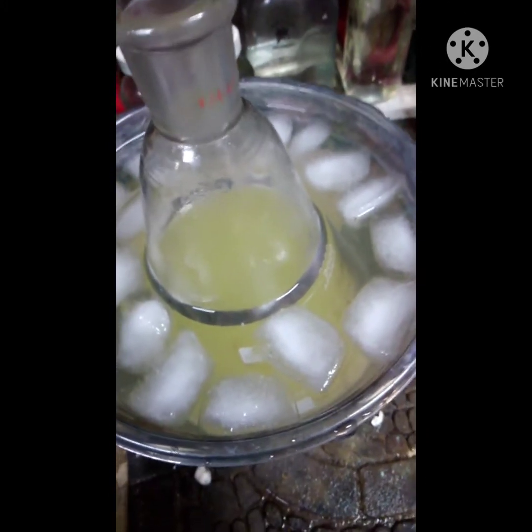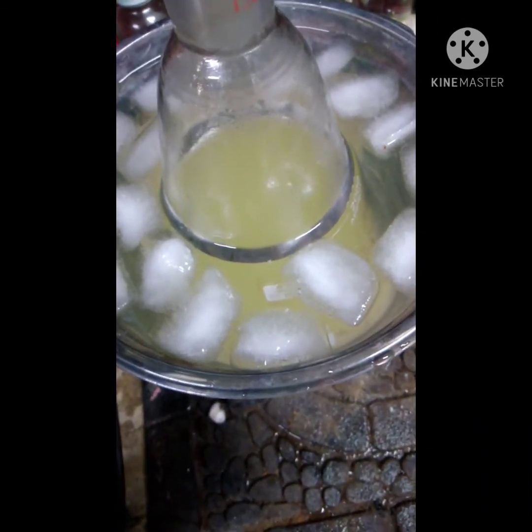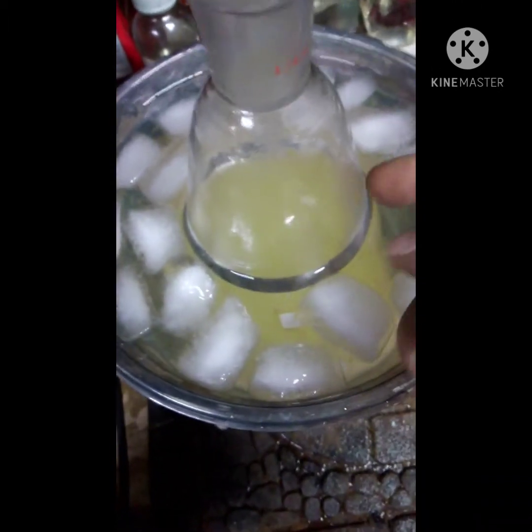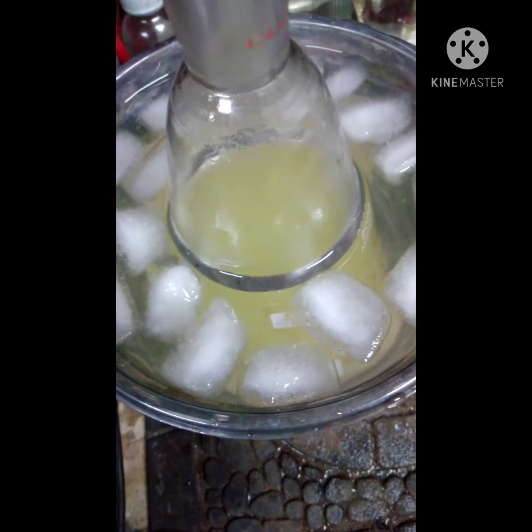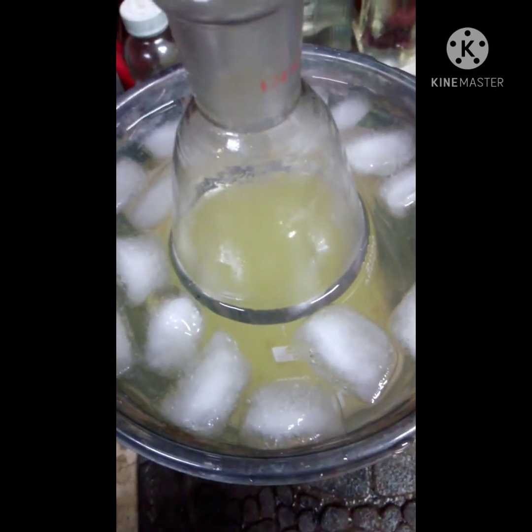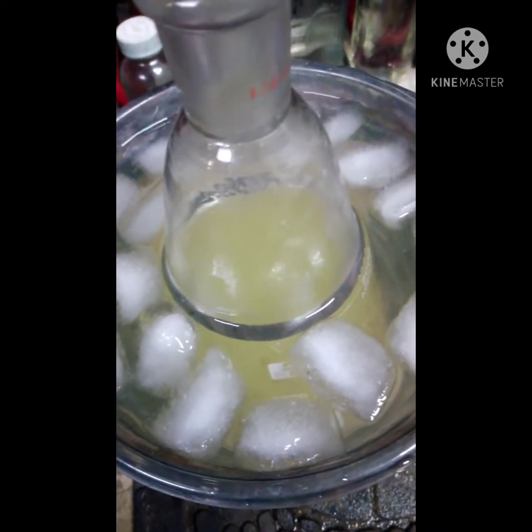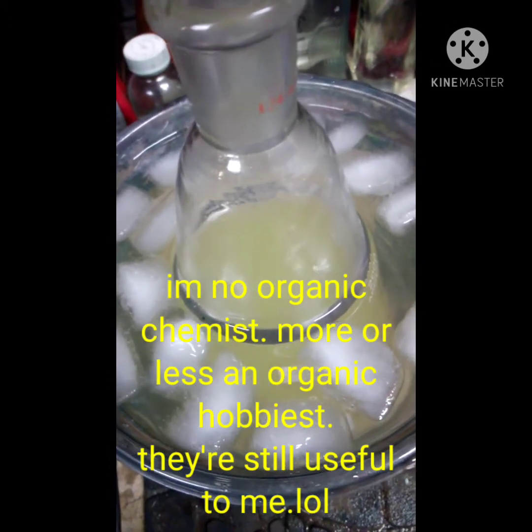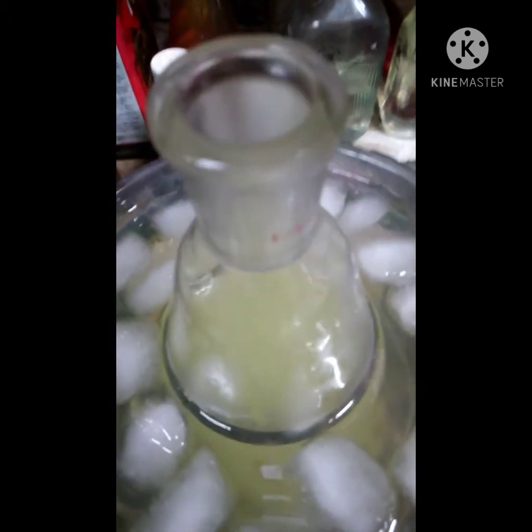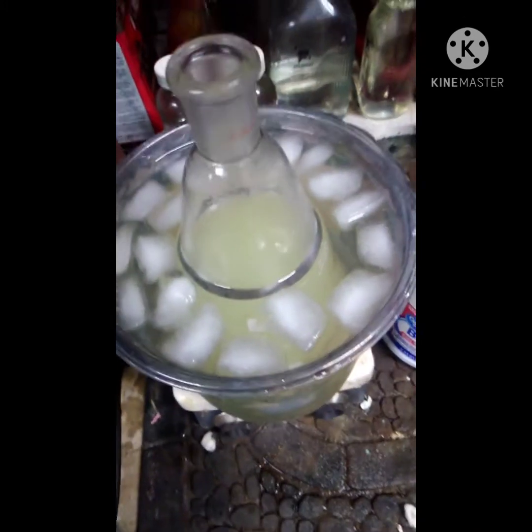The end result of this process is one of two things depending on whether you use MEK or acetone. If you use MEK you get propionic acid, and if you use acetone you get acetic acid. Both of them are heavily diluted with the water left in here, so you have to do another process to concentrate those two. Both are very worth having if you're any kind of organic chemist, especially since you just can't buy propionic acid here in the United States as far as I know.